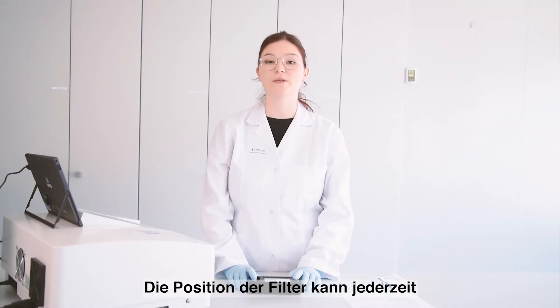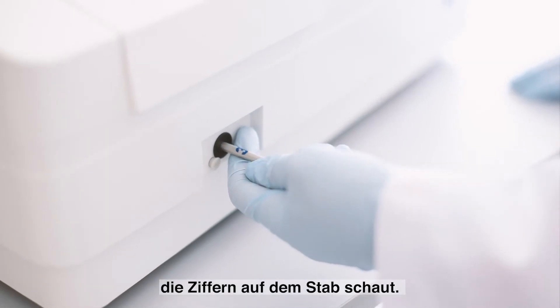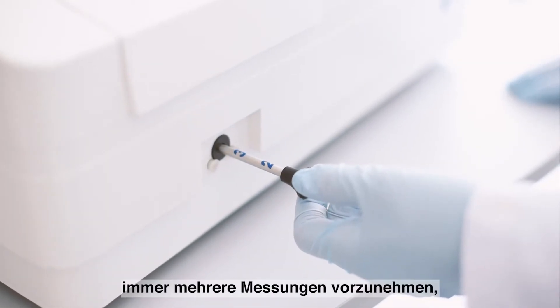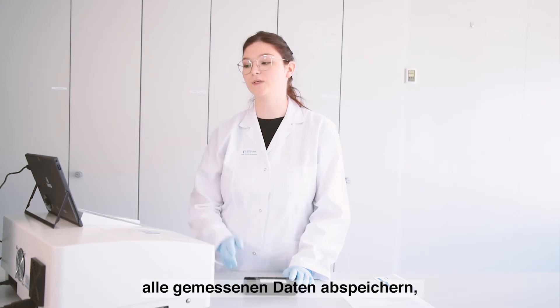You can always check which filter is being analyzed by checking the number engraved on the frame. You should always take several measurements to avoid errors and also save the data you just collected with the PC software.